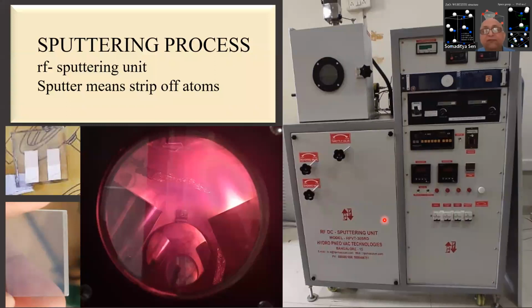And what we do, we put a very high potential, the RF potential, between the target and a substrate on which we want the thin film, and this high potential actually strips off the atoms or molecules from the target material and deposits them. This is a plume of the molecules that are stripped off. There's a plasma actually, and you can see the plasma there. The plume has a shape here, and it is very hard to notice here, but the substrate is here, so the atoms travel all the distance and get deposited on the substrate.